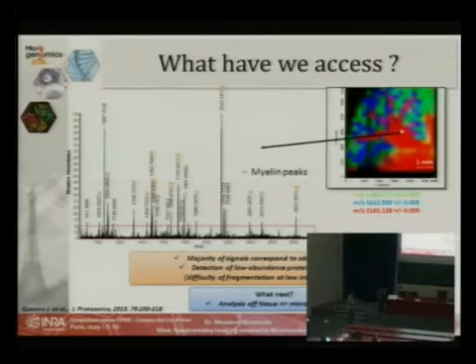To realize this, it's not possible to stay on the tissue, so we developed a technique where we go off the tissue but still keep the information of localization.